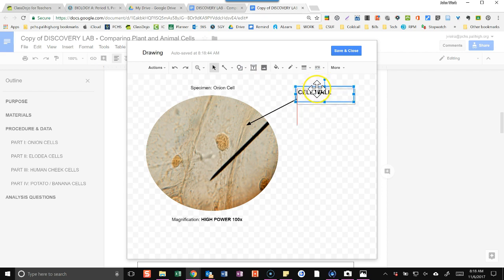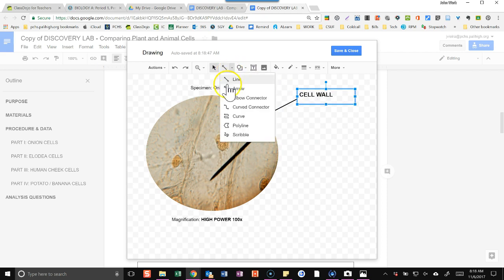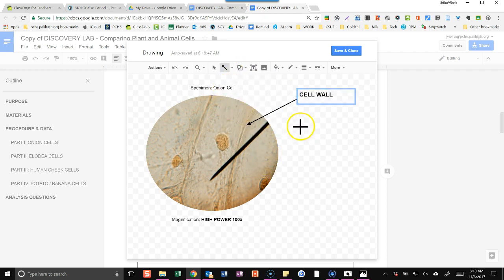Everybody see that? The other thing that I can see is the nucleus, right? Can I see the nucleus here? Yeah. Right there. Right here is the line weight. I think I said 3? 3's pretty good. Keep them all the same.